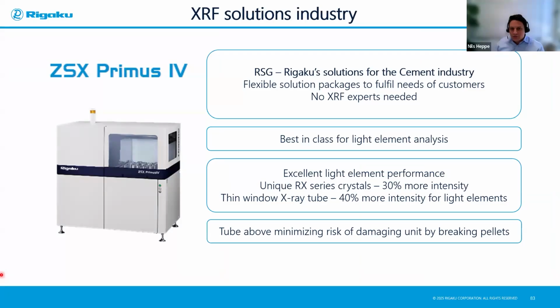So one question is if we can measure boron also as fused bead, or if there's a problem with the boron containing in the flux. Yes. So I tried to show you that, of course, the best method for boron is using a pressed powder method.